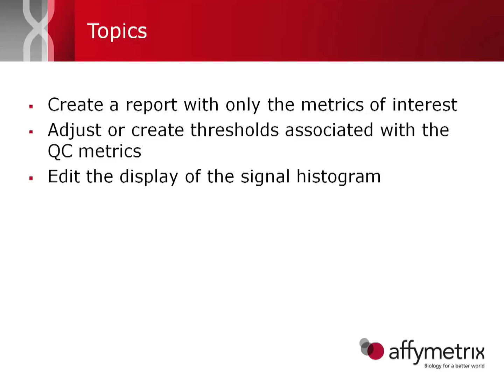Today's video will be a short introduction in how to create a report with only the metrics of interest in it, how to adjust or create thresholds associated with these QC metrics, and how to edit the display of the signal histogram.